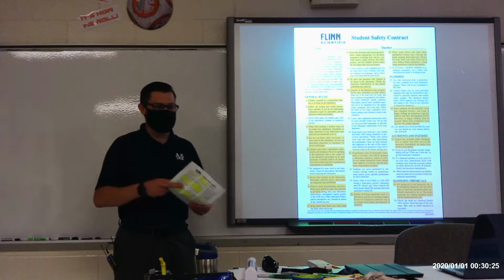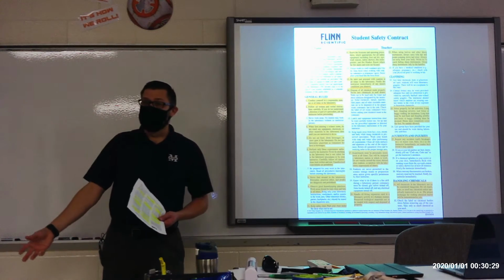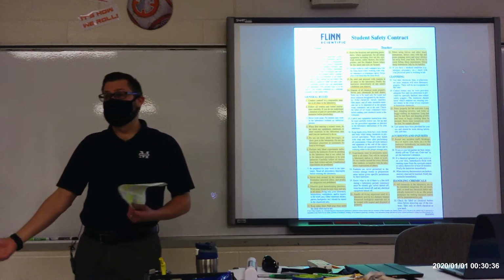And especially if something like glass breaks, please don't try to just clean it up yourself, because I would rather take the time to clean it up than run the risk of you cutting yourself on broken glass.